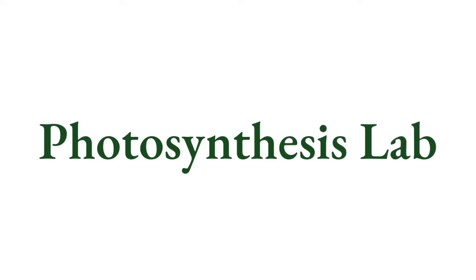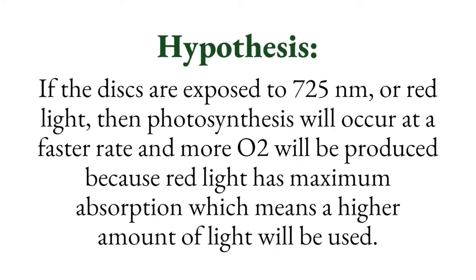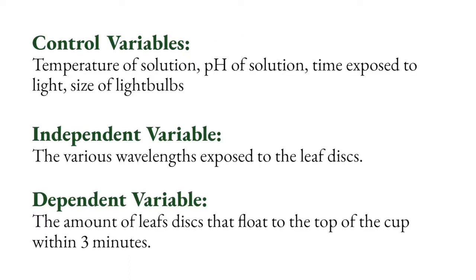Photosynthesis Lab. Purpose: observing the speed at which oxygen is produced in photosynthesis when exposed to different wavelengths of light. Hypothesis: if the disks are exposed to 725 nanometers or red light, then photosynthesis will occur at a faster rate and more oxygen gas will be produced because red light has maximum absorption, which means a higher amount of light will be used. Control variables: temperature of solution, pH of solution, time exposed to light, size of light bulbs.